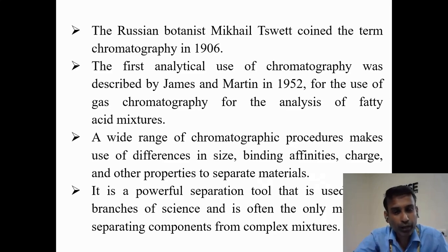It is a powerful separation tool that is used in all branches of science and is often the only means of separating the components from complex mixes. So here, generally for food products, there are numerous techniques to analyze them. First they will prefer chromatographic techniques, spectroscopic techniques, hyphenated techniques, and thermal analysis methods. And among the four different methods, the chromatographic techniques provide the most accurate results.